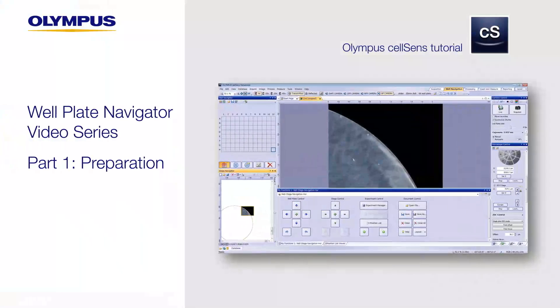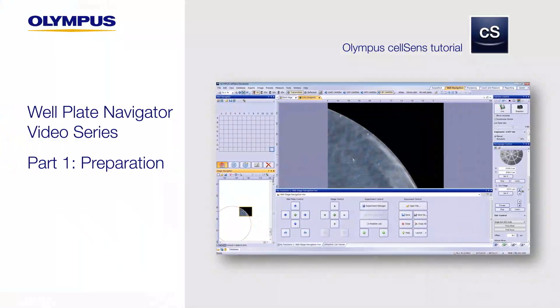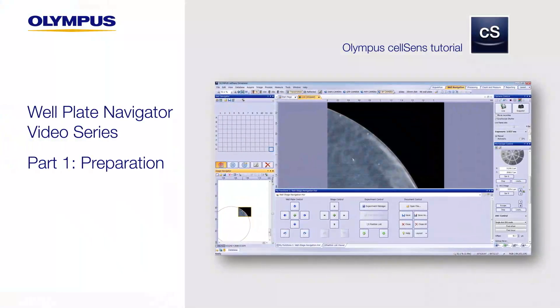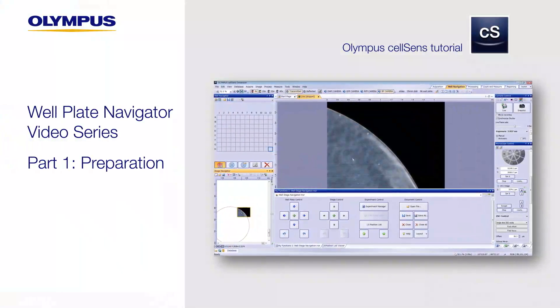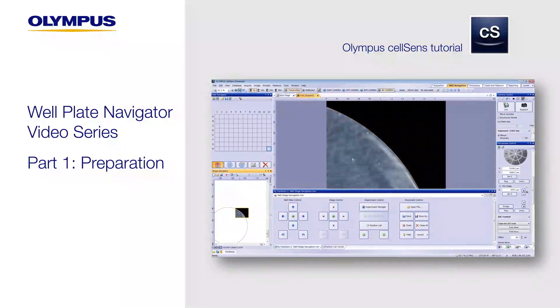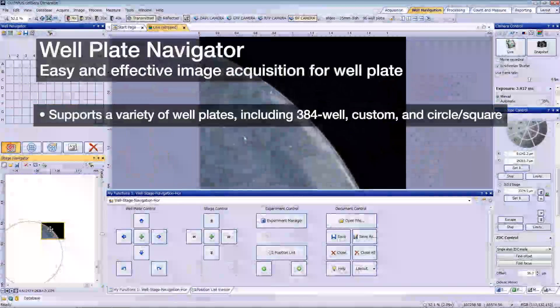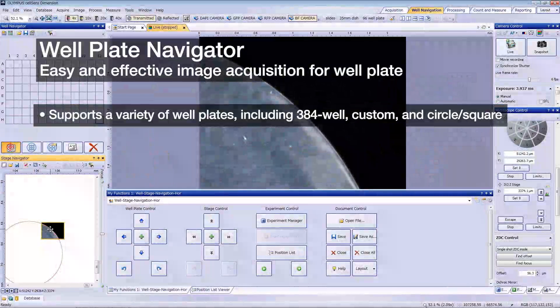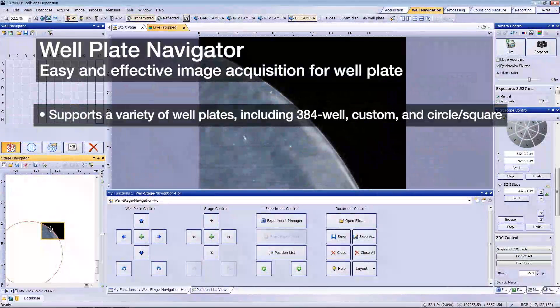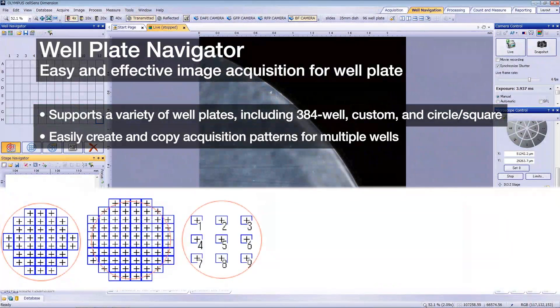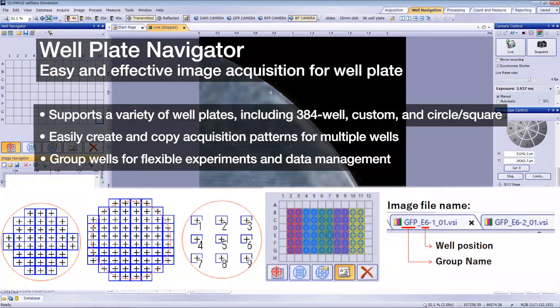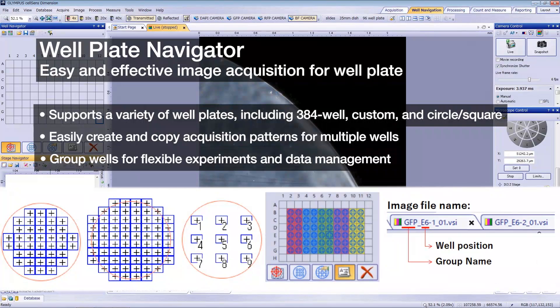In this series, we'll show you how to use the Wellplate Navigator, a simple, effective tool for wellplate acquisition available in cellSens software. The Wellplate Navigator supports a variety of wellplates. It can easily create or copy acquisition patterns and group wells for complex experiment settings and easy data handling.